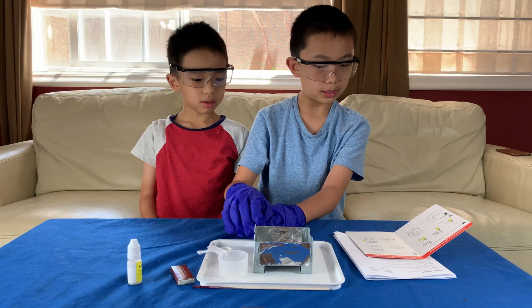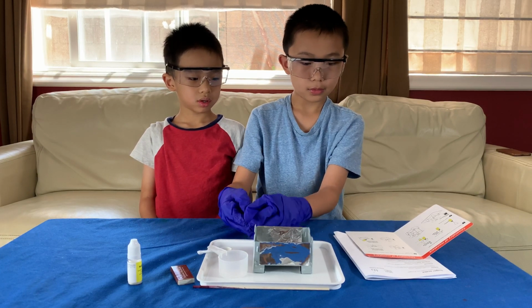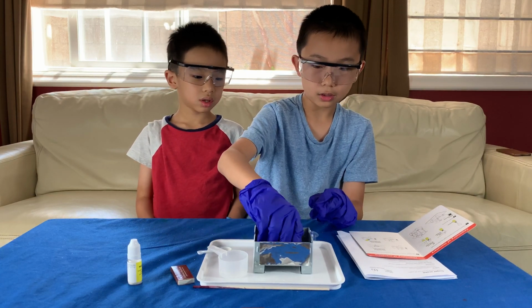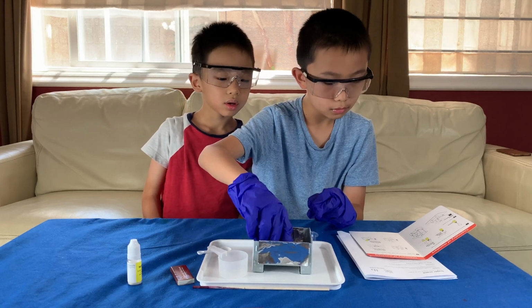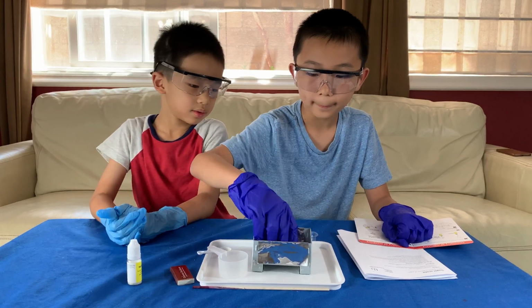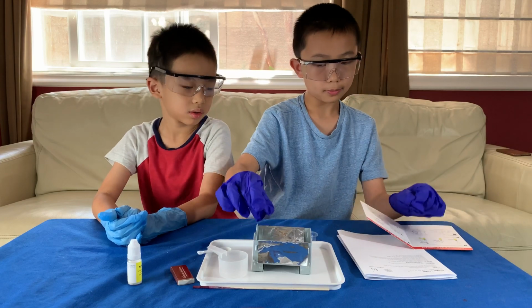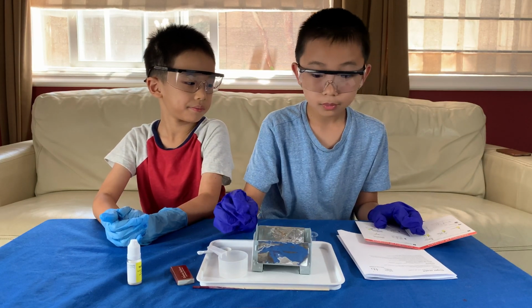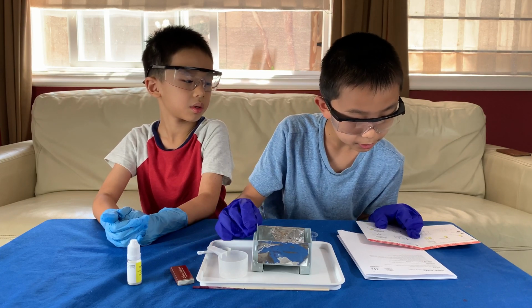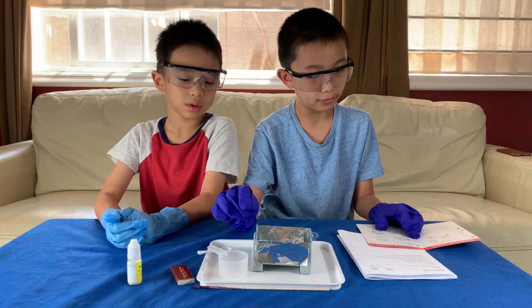And now what we do is we carefully pour. Oh no, first we take out the tablet of solid fuel. Put it inside. Good. Let's see. Place in the center of the stove. Yeah, this way. Okay. And now, we carefully pour the mixture into the recess of the tablet.